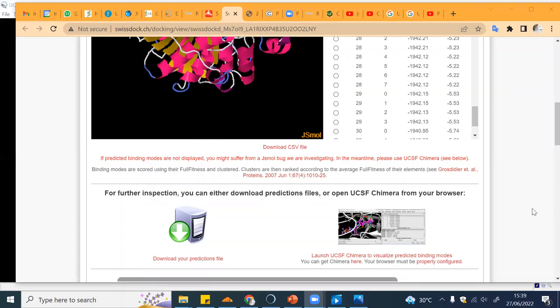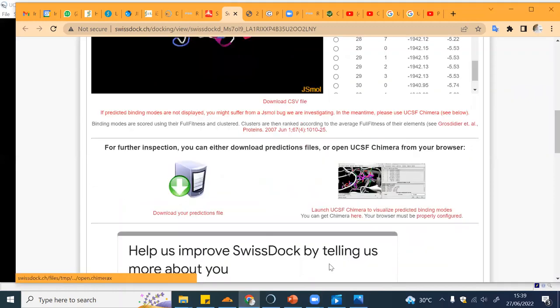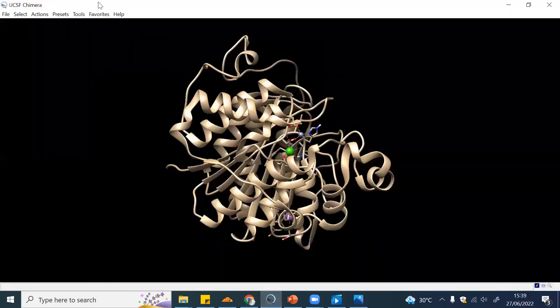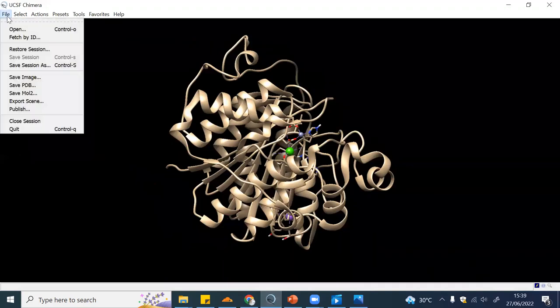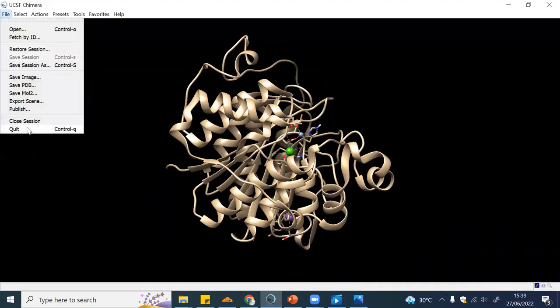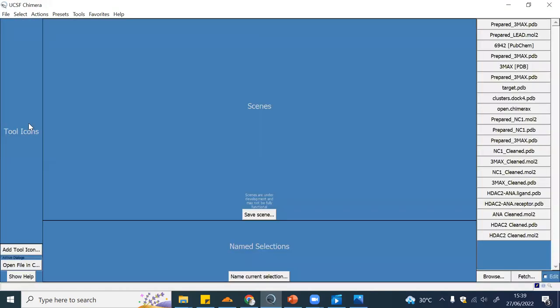Now I will show you how to visualize our data in Chimera. I will just close the session.